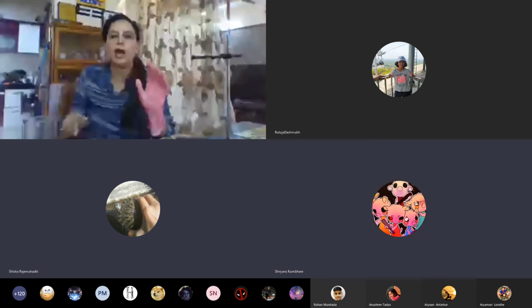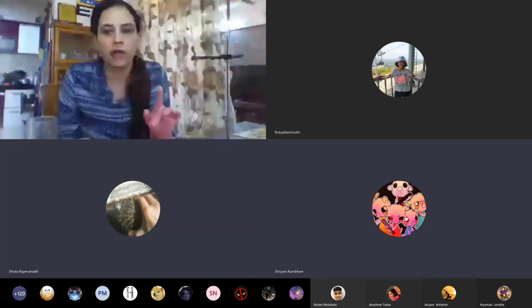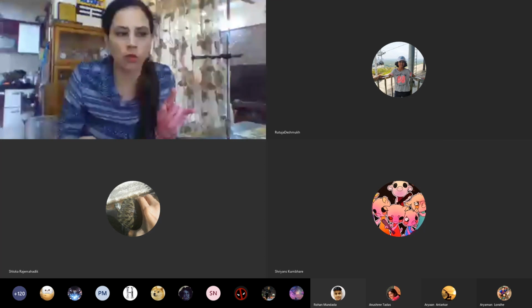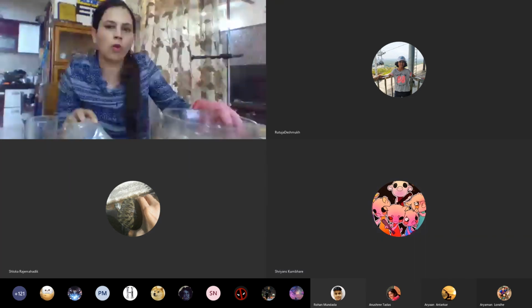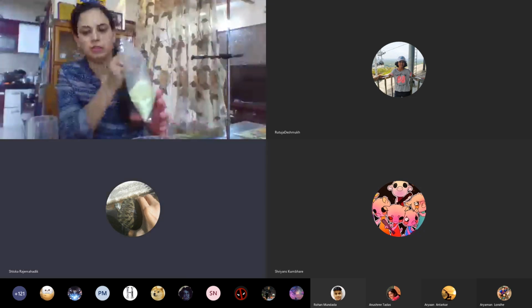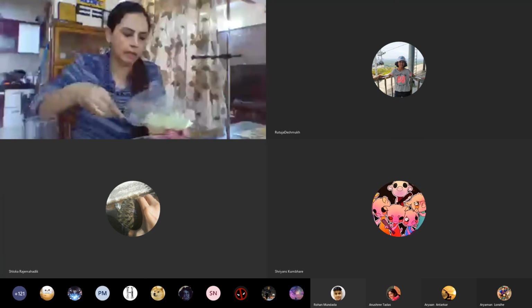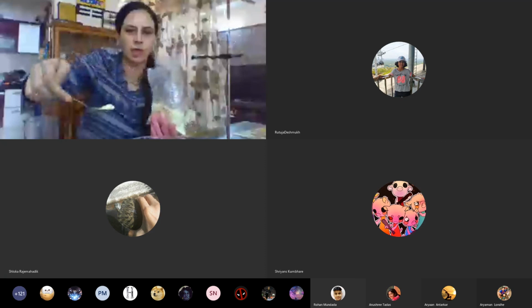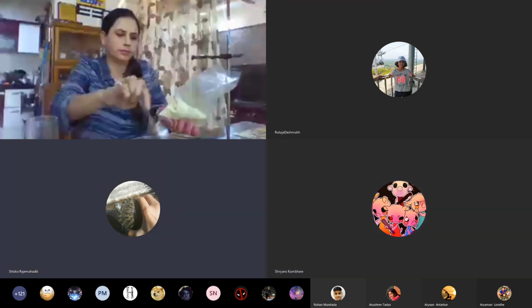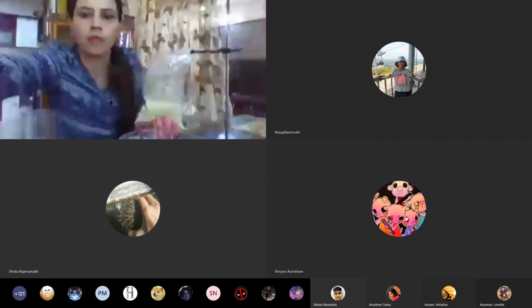Okay, so the last thing remaining is the reaction of sulfur with a base, that is sodium hydroxide. Do you remember what we had in this bowl? Sodium hydroxide. I'm going to add sulfur here. Let me change the angle so that you can see.